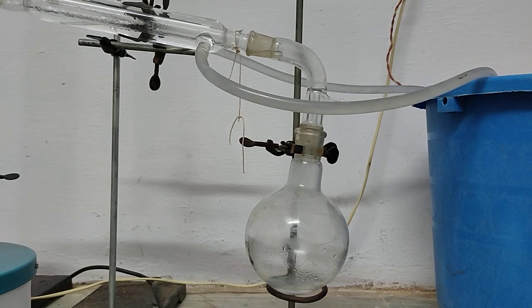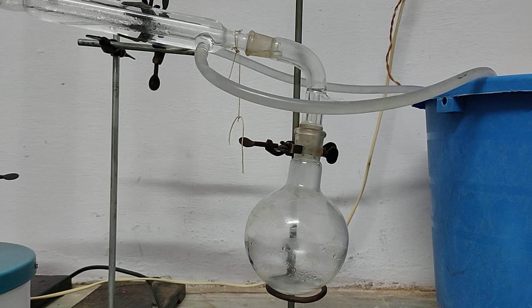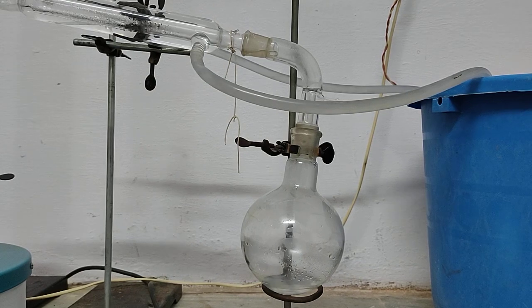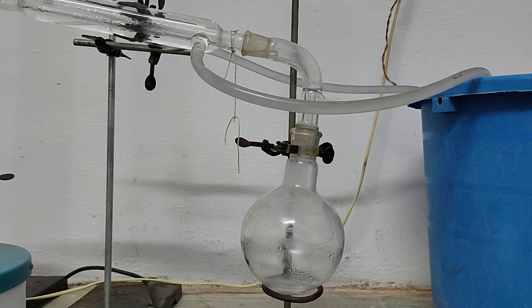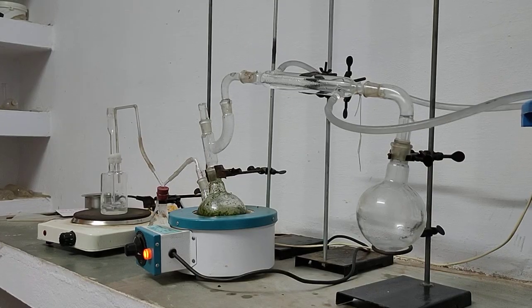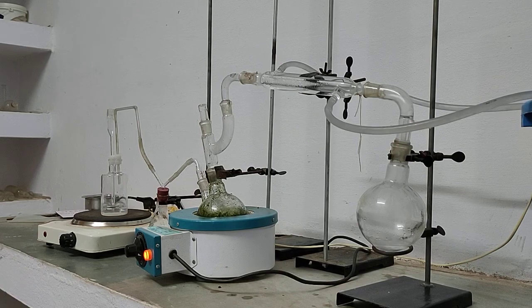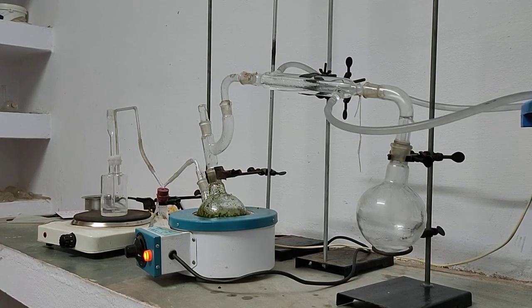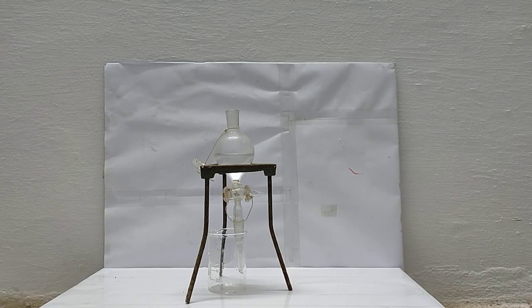Water along with essential oil of tulsi is collected in the receiver flask, which can be separated by separating funnel. Two layers will be formed and can be separated.